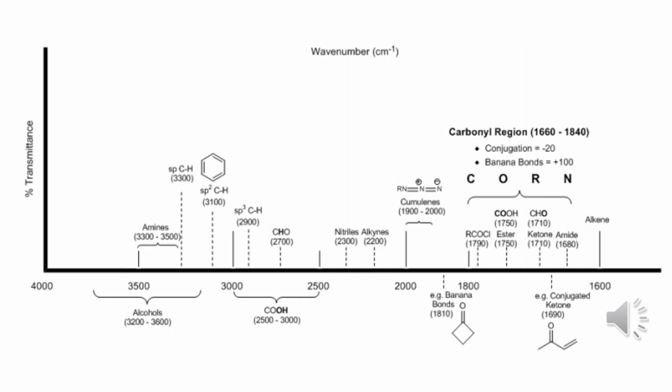Sometimes, spectrometers use single beams of infrared and then split them into component wavelengths. Other designs use two separate beams and use the difference between those beams after one has passed through the sample to give information about the sample. The old-fashioned spectrometers amplify the signal optically, and the modern spectrometers use electronic amplification for the same purpose.